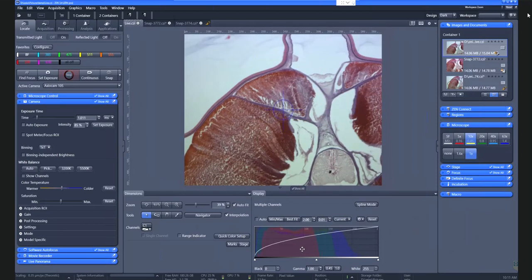And to get a better understanding what this histogram is all about, we must know that we really display the intensities from very black intensity, or intensity of 0, which never exists in our samples. So it's 0 up to, with this special camera, we do have 256 gray values. So the brightest spot would be 255. And we can see evenly distributed all the intensities. Since we hit the set exposure button, I can be quite sure that the image is never overexposed, it's not too dark, and everything is fine.